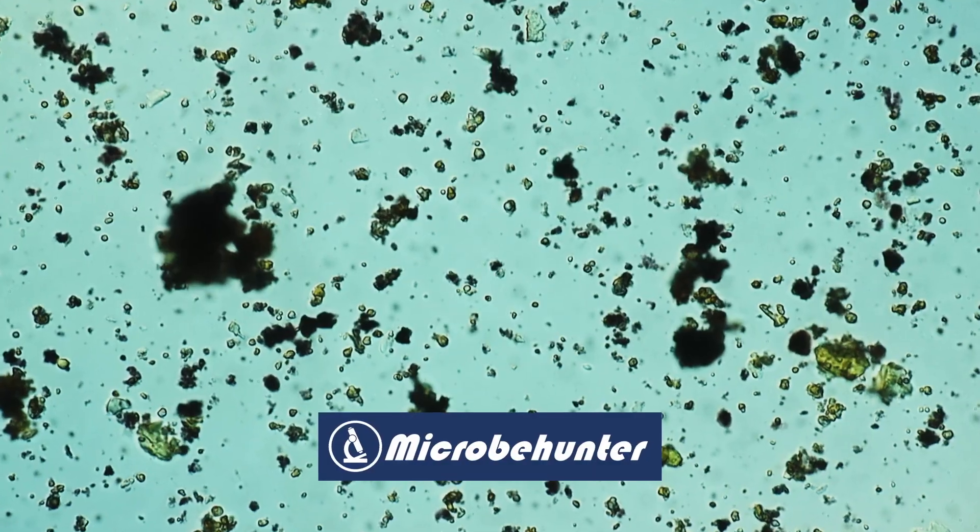Hi, hello and welcome again, Microbe Hunter here. What you see behind me on the computer monitor, those black patches, those black spots, these are starch grains from rice wash water.